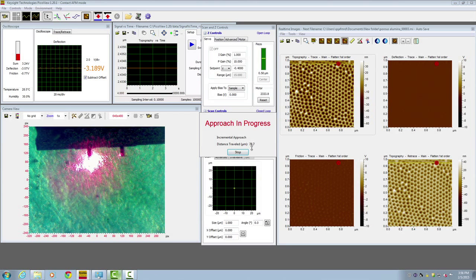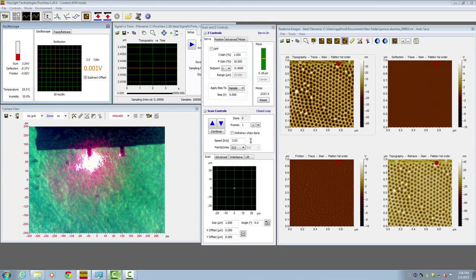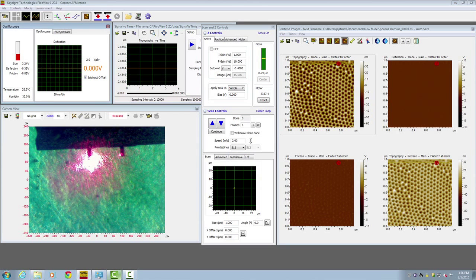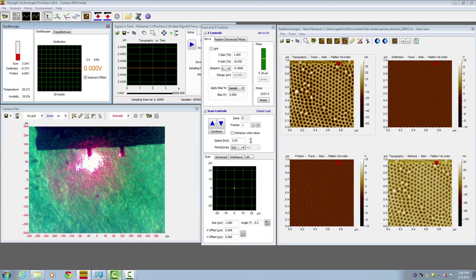Depending on approach speed, this process could take several minutes to 10-20 minutes. Now this window has disappeared, which means the tip and sample have engaged.